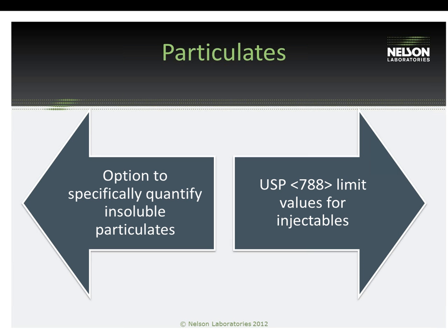And there are limit values for injectables. If you recall, when we were just discussing the gravimetric extractable residue test, we can also remove and quantify those insoluble residues with that test method. However, this particulate test method quantifies just the insolubles on their own. The gravimetric will quantify what's insoluble as well as what is soluble with the solvent that we used with that test method.